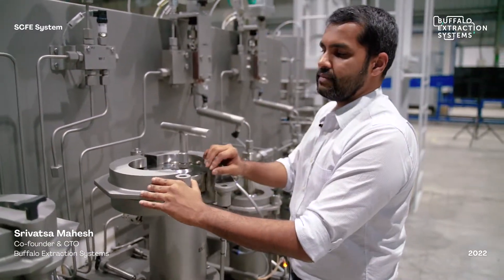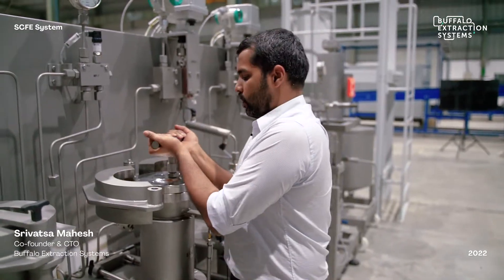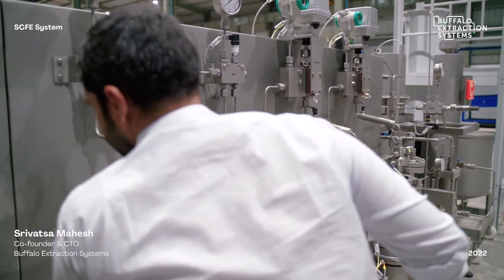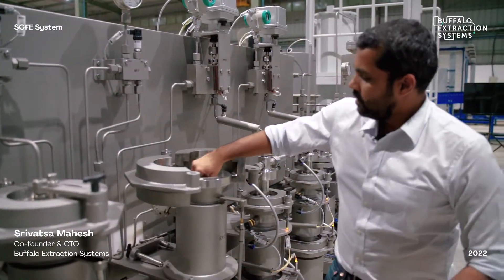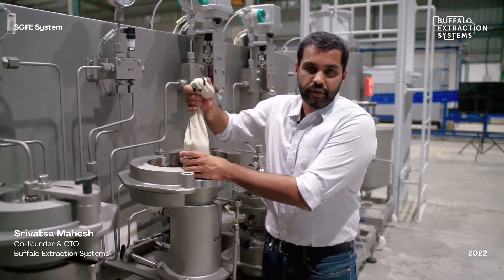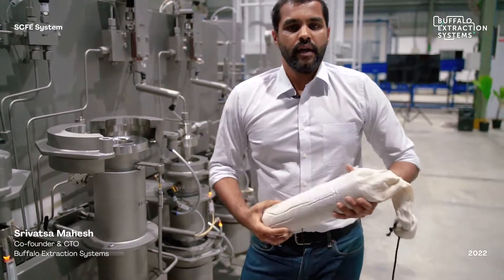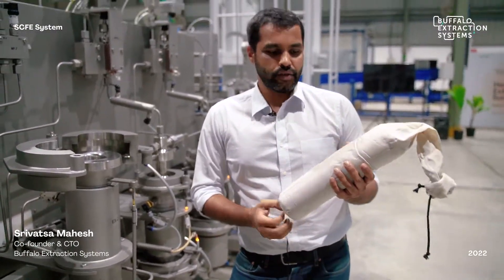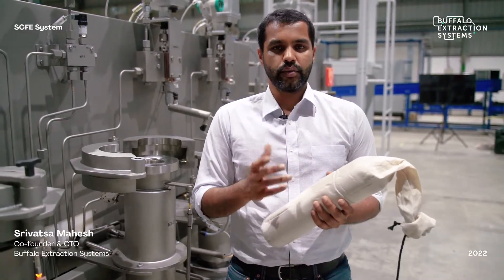Typically these extractors can be operated or opened up with just one operator, and the biomass is loaded in here in a polypropylene food grade bag. This bag helps ensure that your CO2 actually passes through all the biomass without any channeling, and the biomass put in here is typically of a 16 to 24 mesh size.